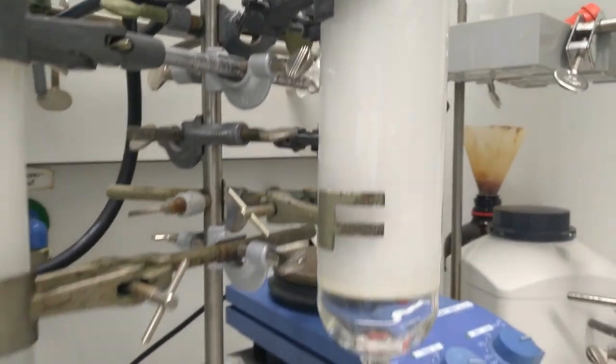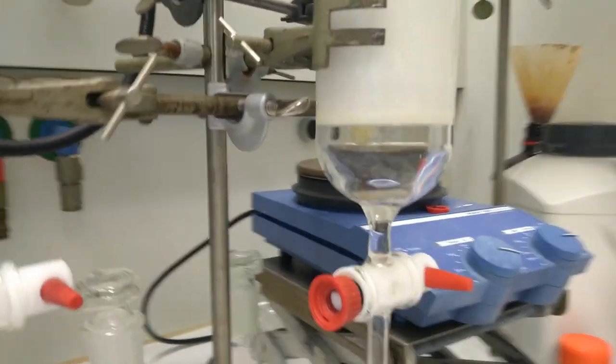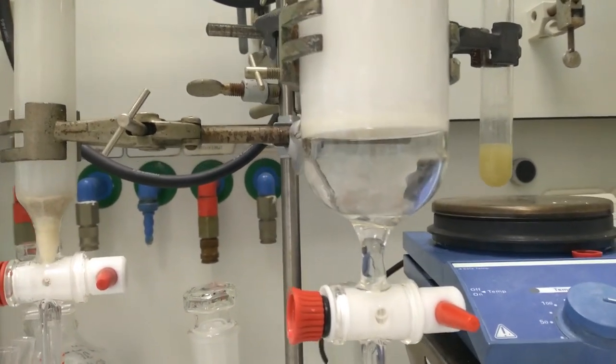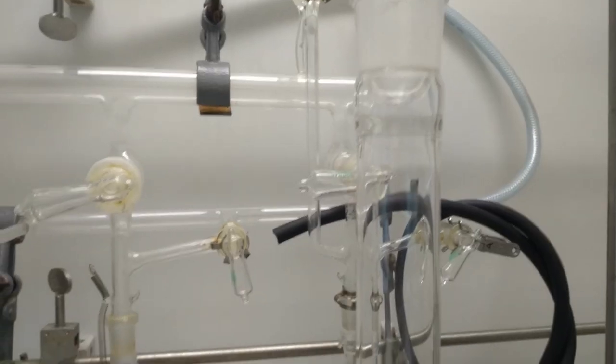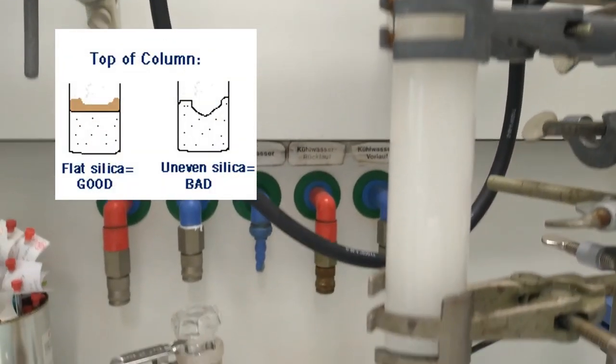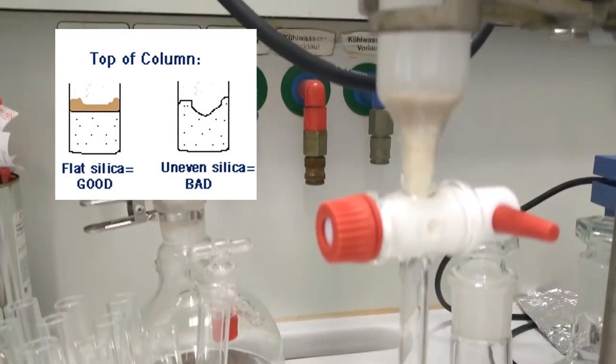Some of the bigger columns already have silica pad inside it. In that case, we need not use cotton or sand in the bottom of column. But always use either sand or cotton on the top of silica packing to avoid the disturbance on the surface.